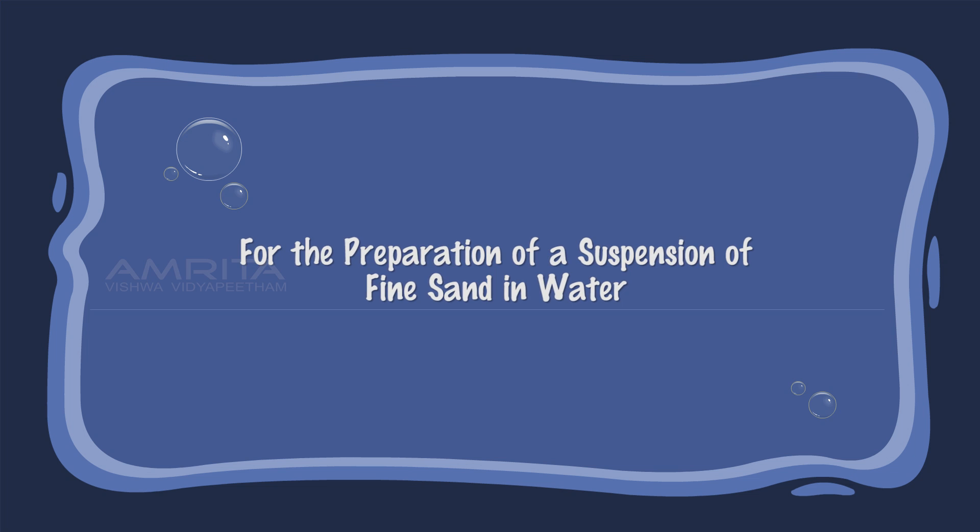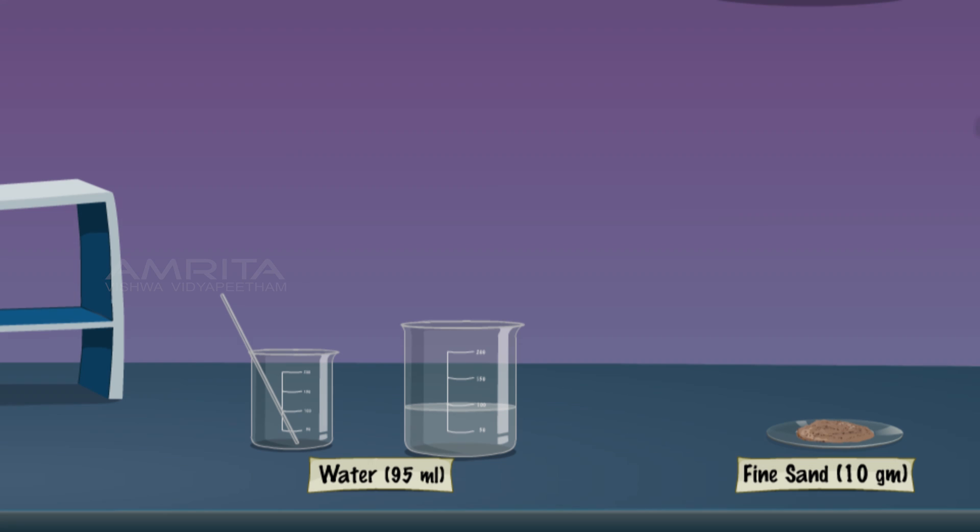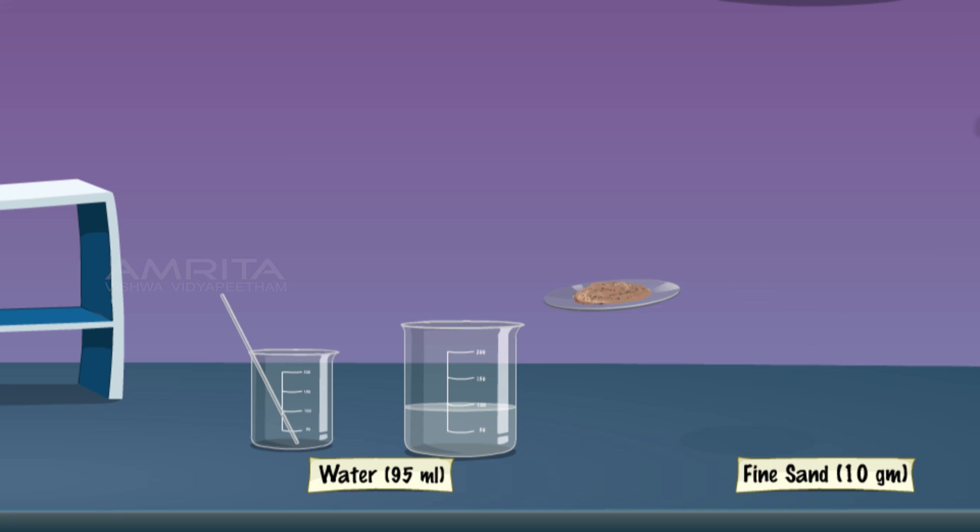For the preparation of a suspension of fine sand in water, add 10g of fine sand in a 250ml beaker containing 95ml distilled water. Then stir using a glass rod.